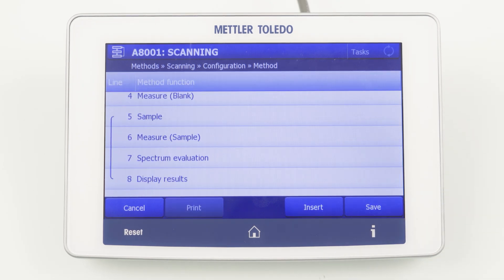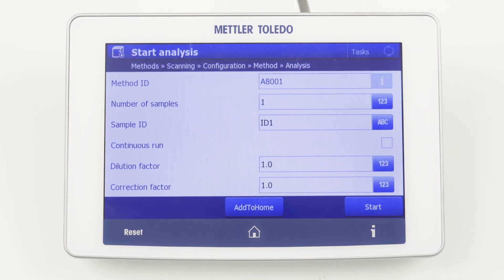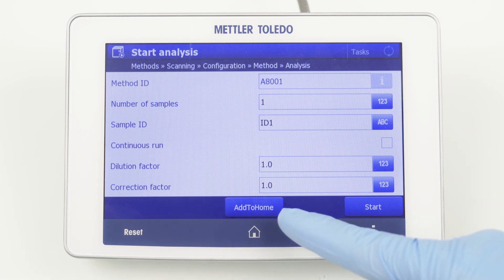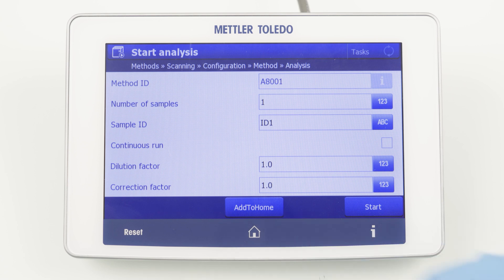Now we can save the method and we are ready to start it by clicking Start. We can define the sample ID or click on Add to Home, which will create a shortcut on the home screen. This is highly recommended for frequently used methods, as they can be started with one click.